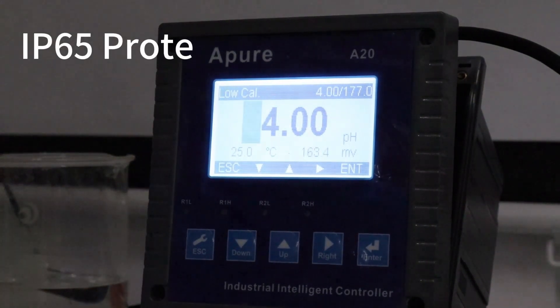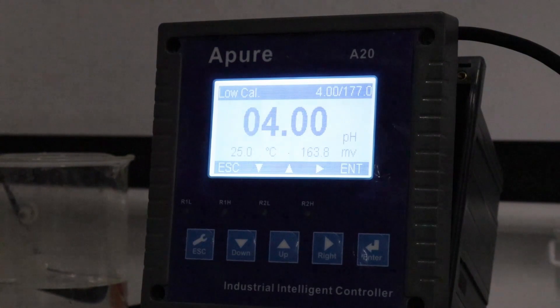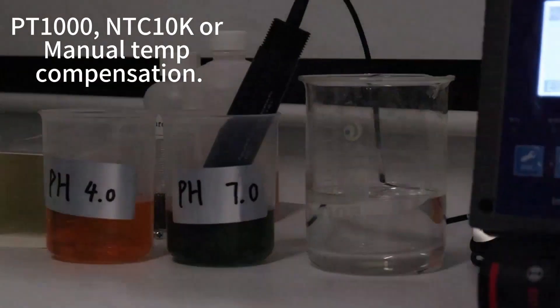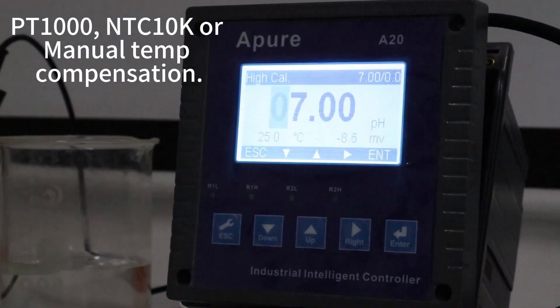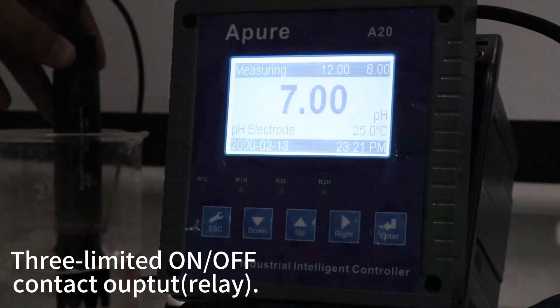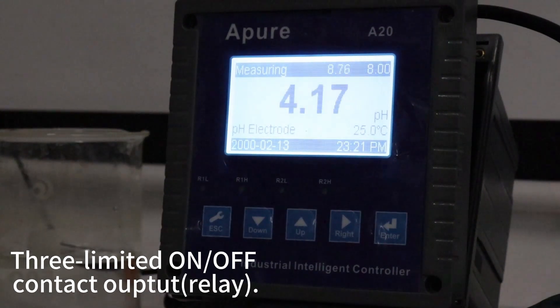Panel or wall mounting options are available for a variety of industrial scenarios. Wide voltage input range, as well as IP65 level protection, ensures reliable operation in various harsh environments. Supporting PT1000, TC10K, or manual temperature compensation ensures the accuracy of temperature parameters.